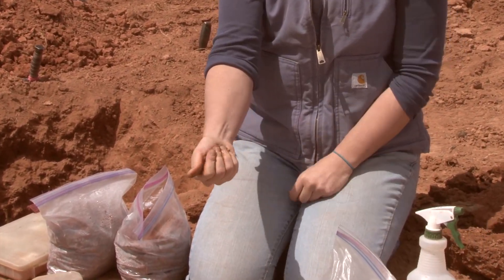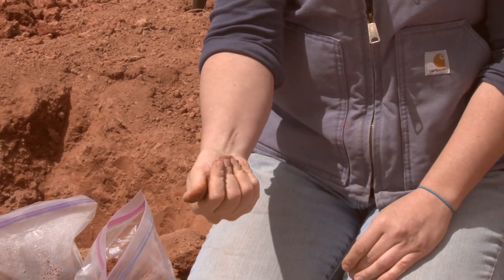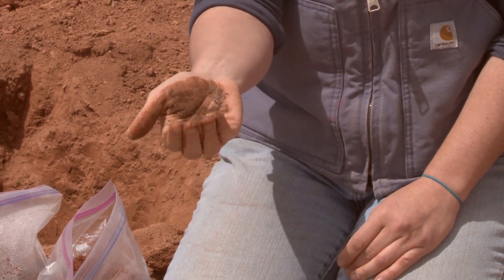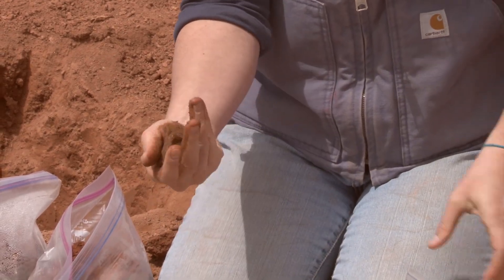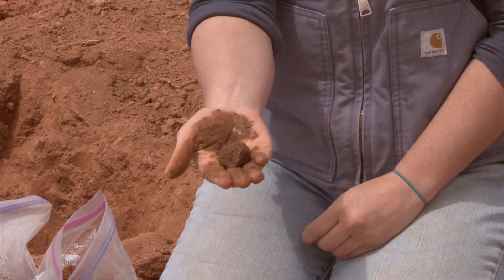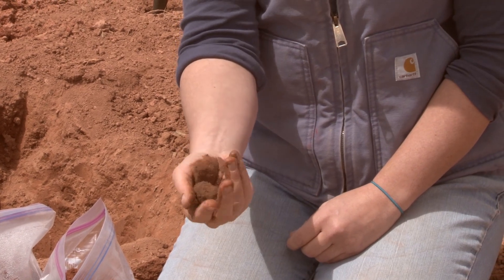So if it forms into a ball, we know we have enough clays and silts to hold that material together. But if it doesn't form into a ball, we're looking at something that's probably just a pure sand. I can get it into a bit of a ball here, maybe add just a little bit more moisture to it. Another test we can do is whether or not it holds together if I pick it up and drop it. It's holding together pretty well, so I know it's definitely not a pure sand because it's making a ball and it's holding together.